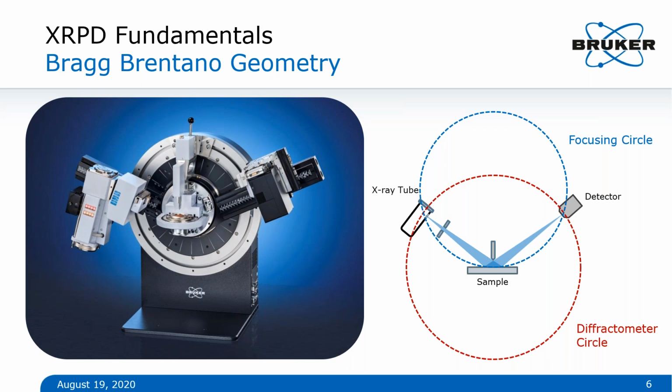I think we are back to the slides now. Yeah, I just had to switch over from applications. So that should give you a pretty good overview of what happens during an X-ray diffraction experiment. And of course, like most analytical techniques, we don't generally think too heavily about the math on a day-to-day basis. But I think that for those of you who aren't familiar with the technique, it provides a really, really good overview of where the data comes from that you end up seeing when you analyze your samples.